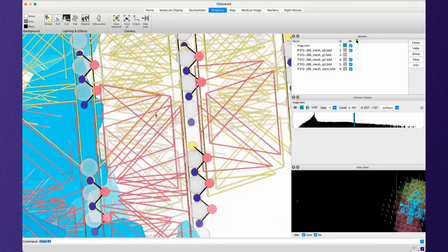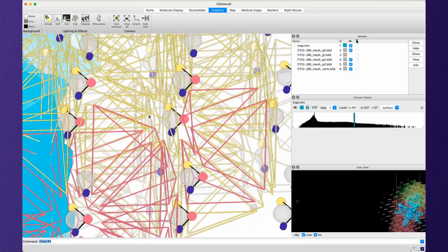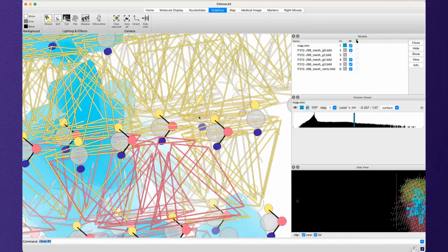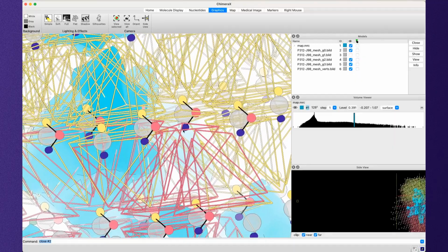The other thing to note here is that even though there are interspersed yellow and pink tetras, they never overlap perfectly. And that's because they're fused. It wouldn't make sense for us to fuse the yellow and pink tetras and then have a copy of the yellow in there because they must deform in the same way. And so what we do when we mark a segment as a root or as a parent of another segment is we say any tetrahedra that belong to both the yellow and pink mesh, in this case, we replace with just a single tetrahedra that belongs to pink. And then any vertices that are used by the yellow and pink meshes must move together.